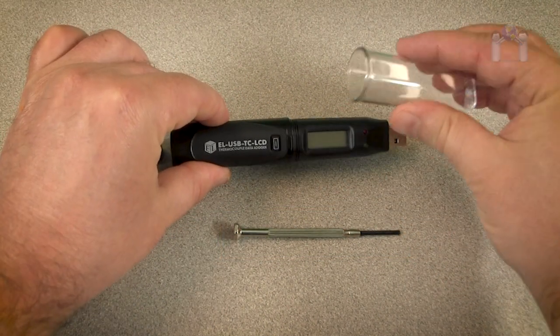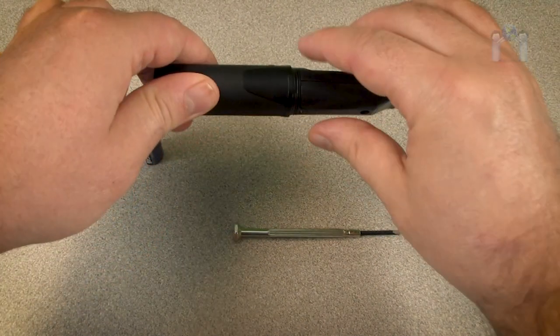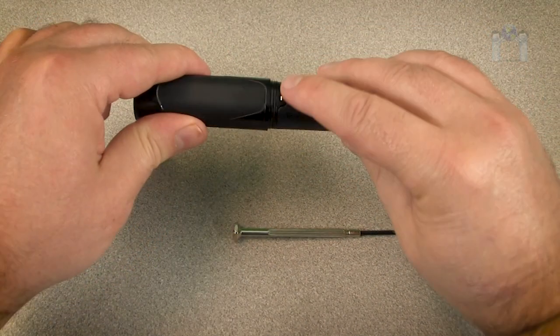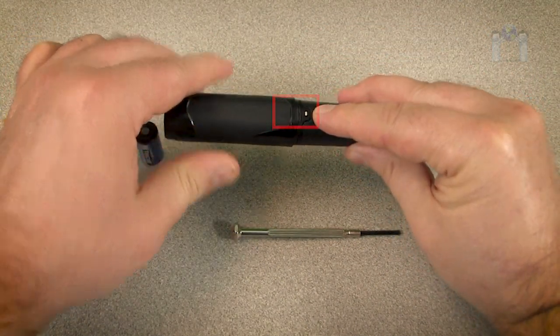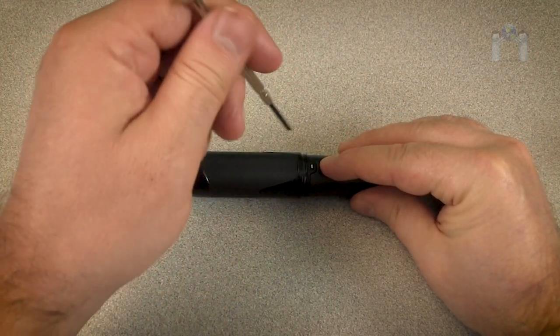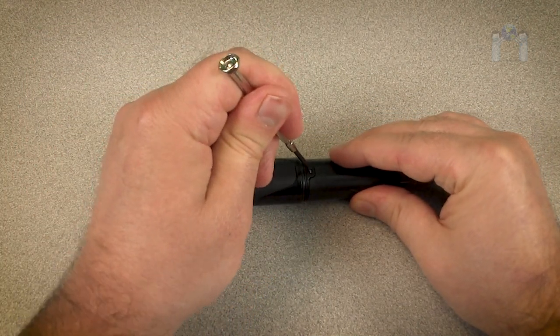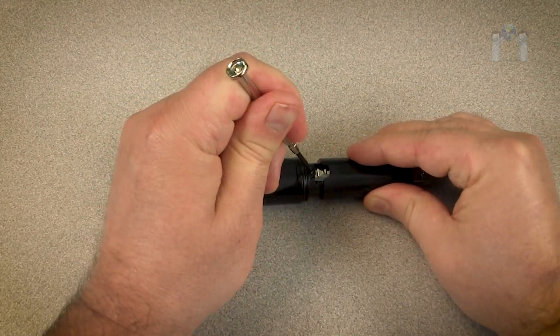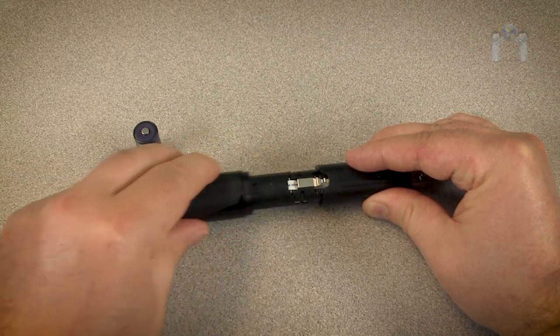Remove the cap and locate the small silver clip on the side of the data logger. Take the jeweler screwdriver and press down on the clip until you feel the cover give way. This may require a little practice.